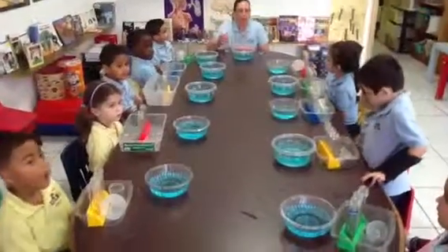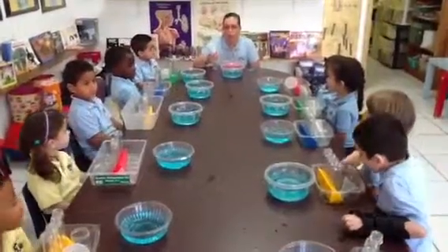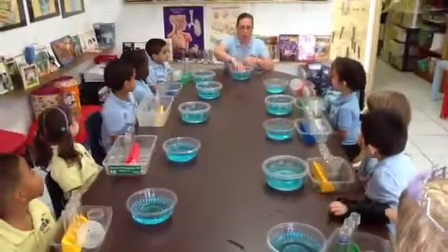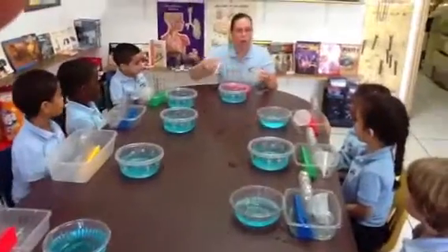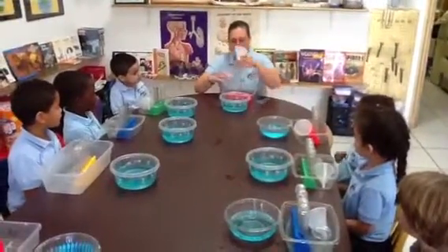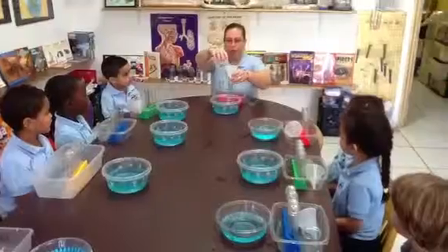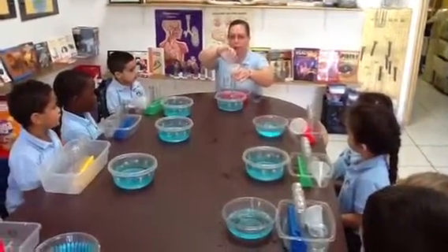This is a funnel. Everyone say 'funnel.' It's a funnel.